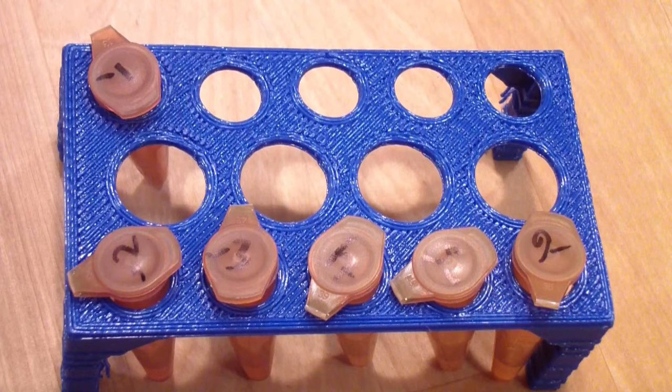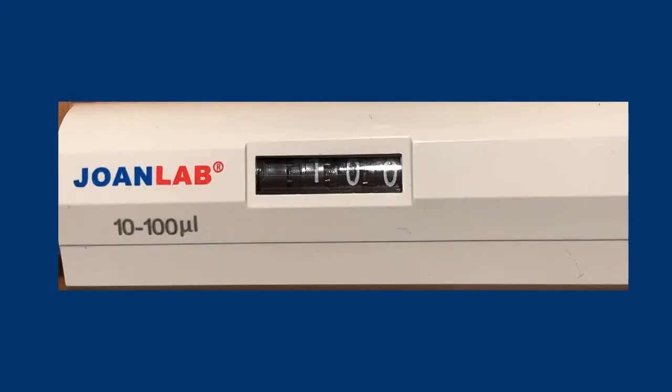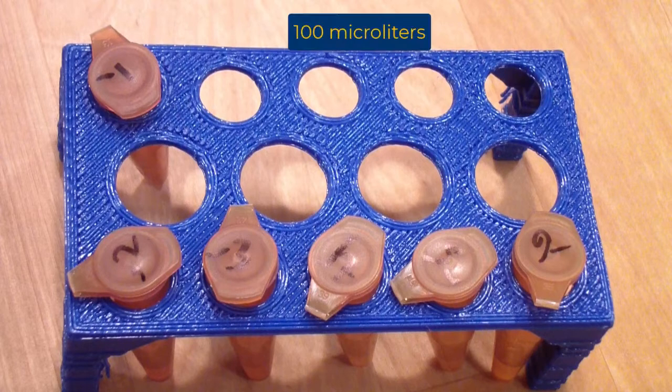Label the Eppendorf tubes with the same dilutions. Set your pipetter to 100 microliters. Pipet 100 microliters of TSB into the first Eppendorf tube.